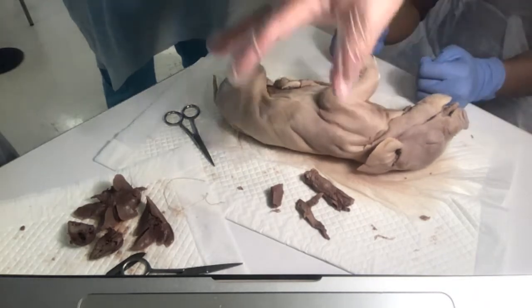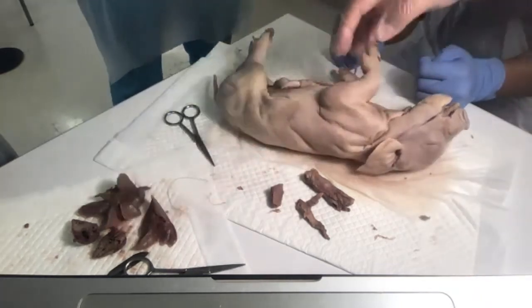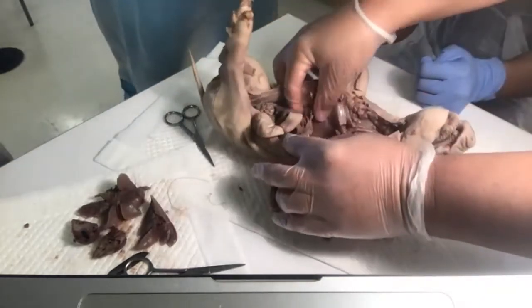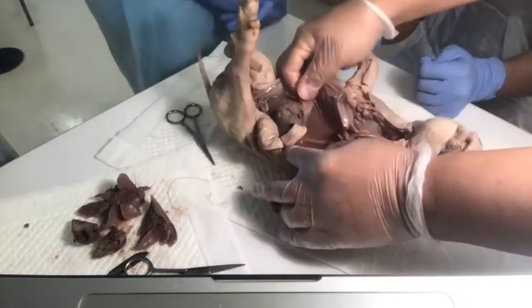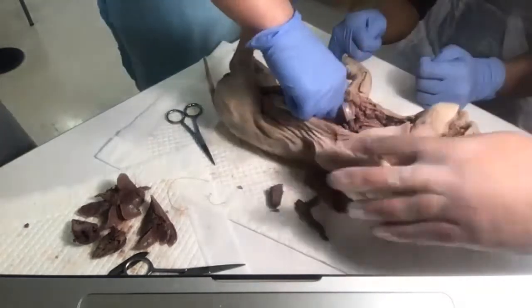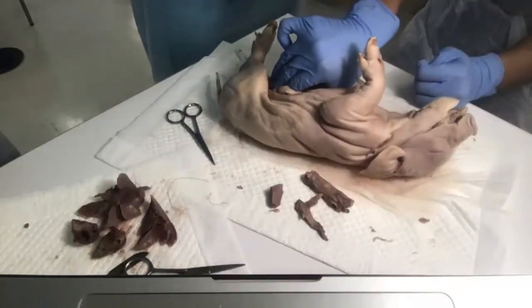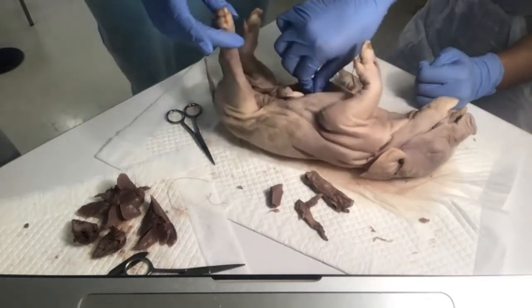All right. So now we didn't see the pleura because, just like the pericardium, we cut it all out. Now, before we move down, does everyone see this thin muscle here? Feel it. It's hard, and that's how I know it's a muscle. That's, of course, your diaphragm. Remember the two muscle sets that are important for inhalation. I need that thin muscle, the diaphragm, and I need my intercostal muscles.